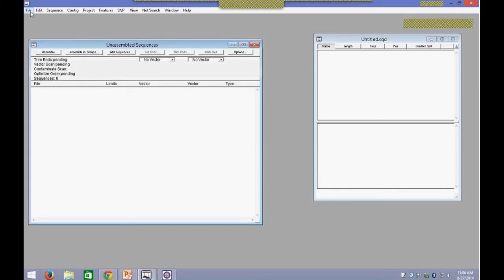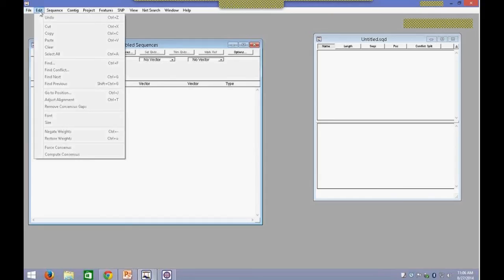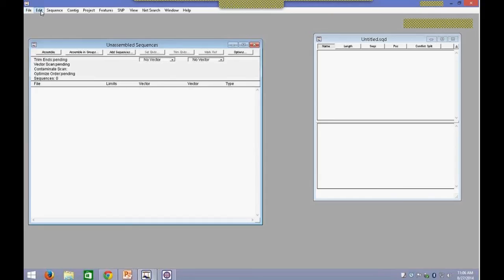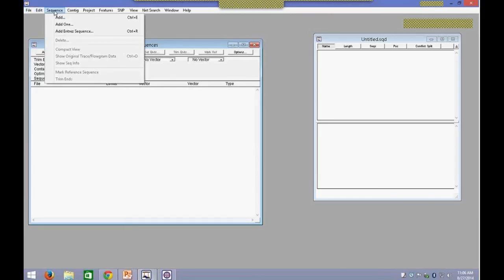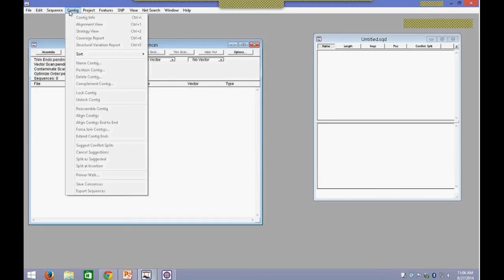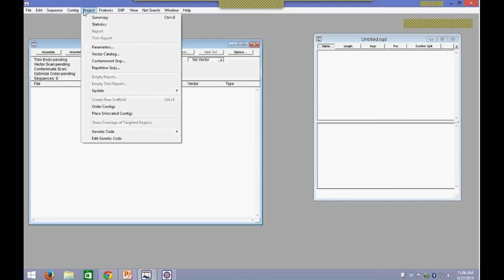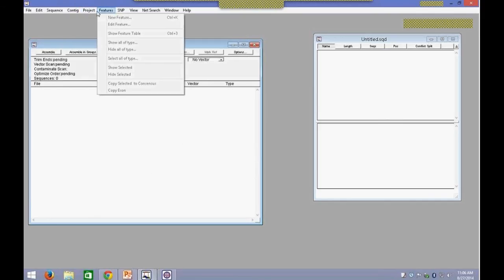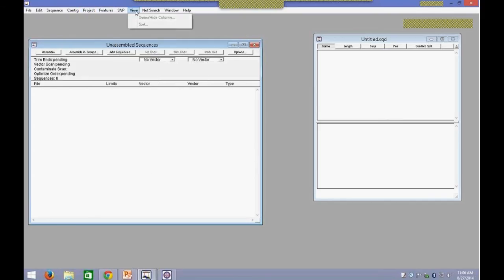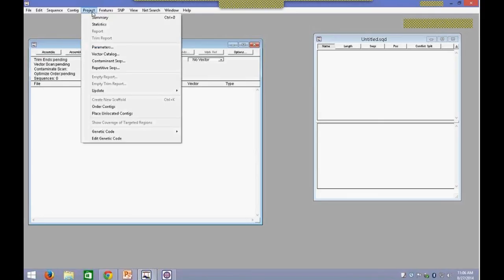On the top, we have the conventional file menus — File, Edit — and then we have some more advanced options for sequence editing, contig analysis, parameter adjustment, and looking at some other views in the software. Before starting your assembly and importing data, I would recommend going into Project and looking at some of the parameters.